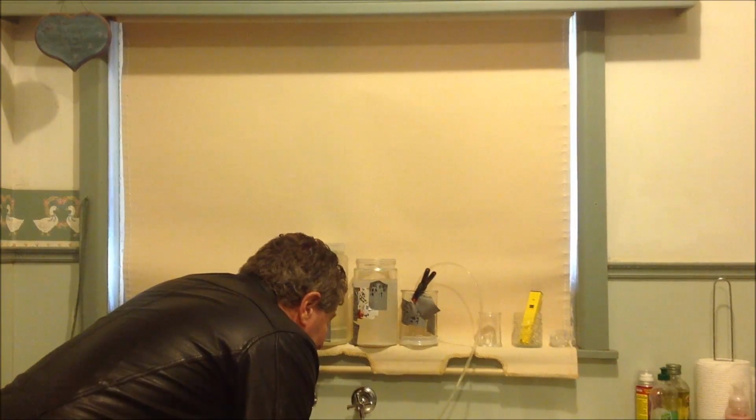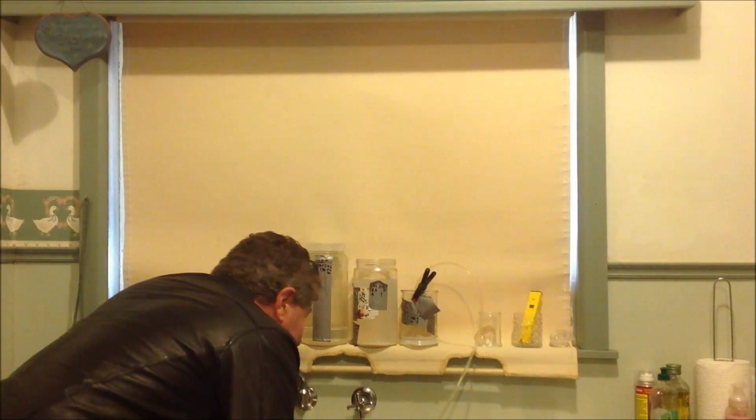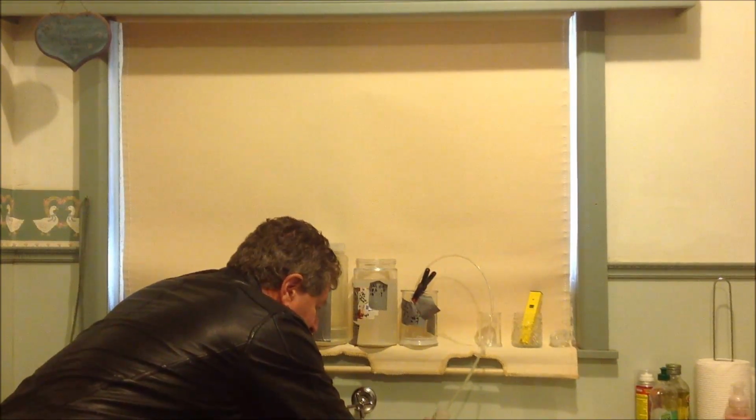I'm just going to leave a slider down in here. I don't want to get any of the precipitate out. Just go right down to the end. Nice little siphon tube here. Here we go. It's all done.